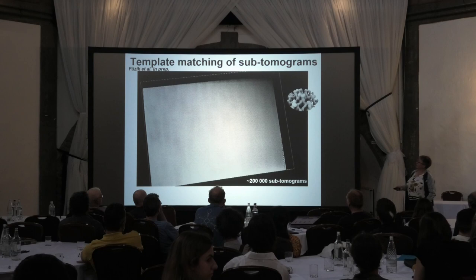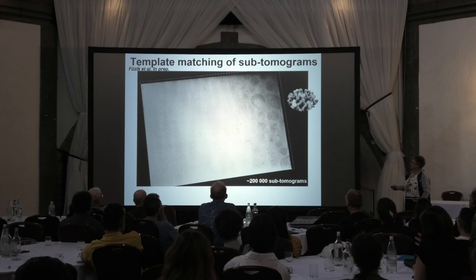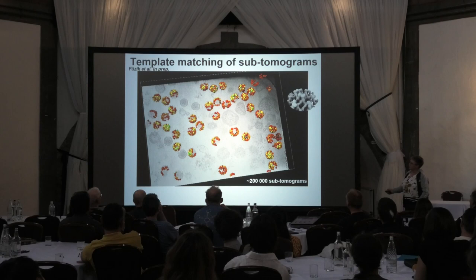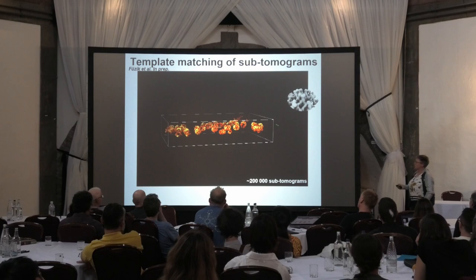Oh, my God. There we go. So this is a tomogram of the immature virus particles. You can see them appearing here. It's quite a mixed bag of things in this particular tomogram. But then what Dubois has done is gone in and done template matching within those individual immature particles to see, well, are they always distorted on the side next to the water interface, or does it vary throughout the preparation? And it turns out it varies throughout the preparation.